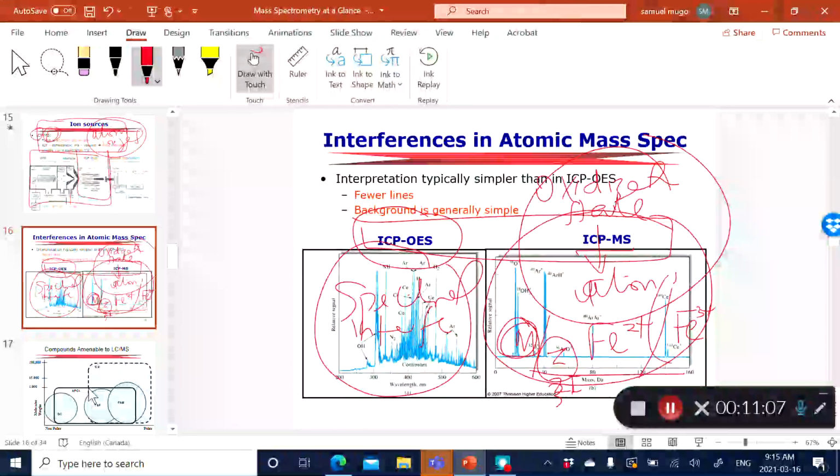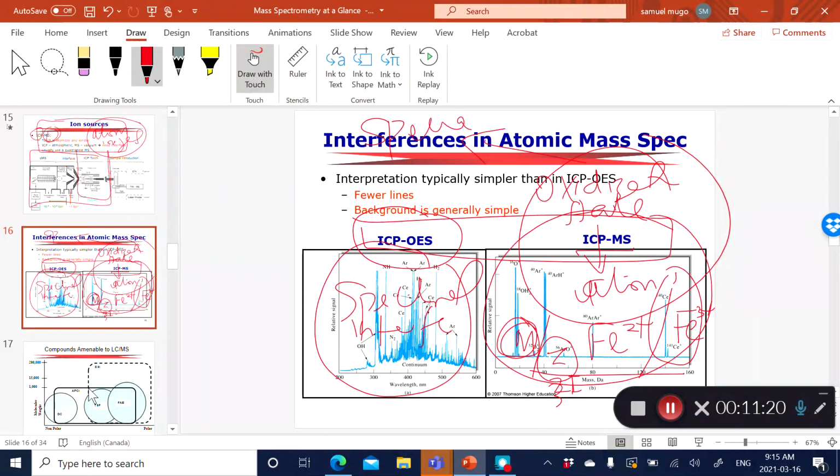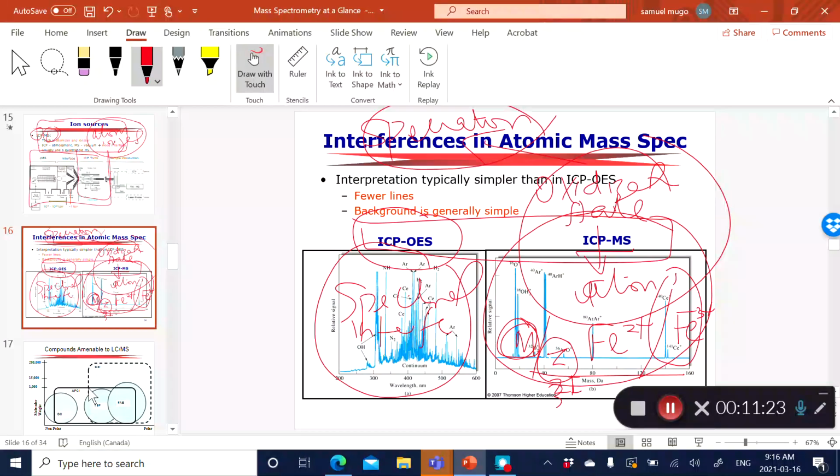If I look at this, you've got selenium, you can differentiate different types of selenium as well. So again, very important for speciation. Speciation refers to when you're looking at in what oxidation state is my analyte. Is it a high oxidation state, low oxidation state, and so on. And oxidation state is very, very important, especially in environmental toxicology, because it determines the toxicity of your analyte.